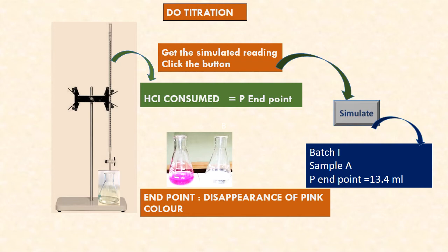Let me simulate again for batch two students. Sample B phenolphthalein endpoint is 7.1 ml — please make a note. Simulating once again for sample C: phenolphthalein endpoint is 13.1 ml.